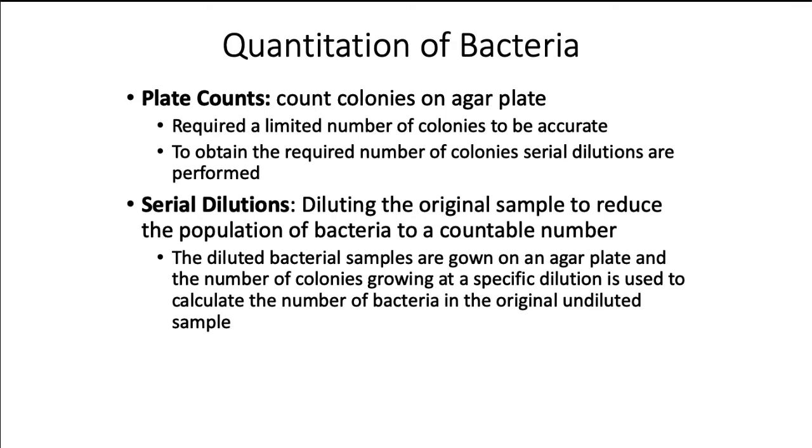There are a number of ways to do that, but one of them that you will see in the simulation is what we call plate counts. It's exactly what the name says. You put your bacterial suspension on a petri dish, on an agar plate, and then you count the colonies. And what are the advantages of this method?